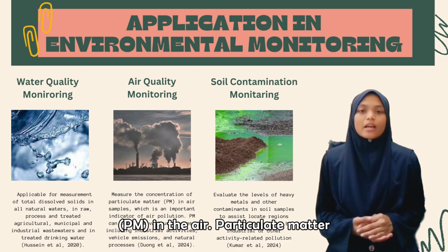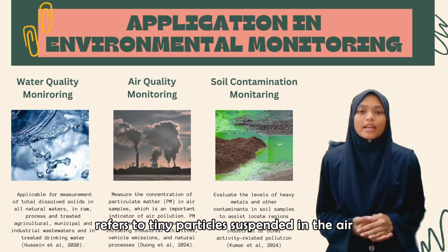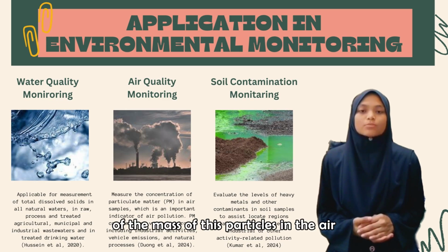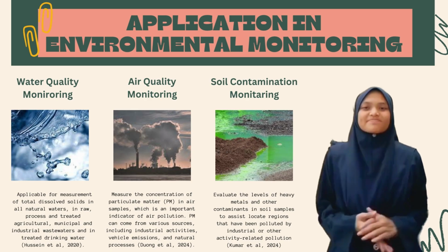PM in the air. Particulate matter refers to tiny particles suspended in the air that can have harmful effects on human health and the environment. Gravimetric analysis allows for the accurate measurement of the mass of these particles in the air.